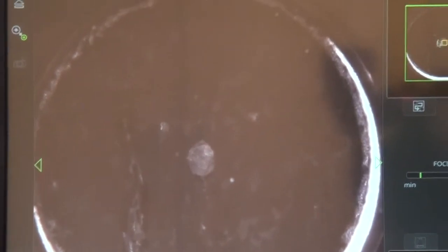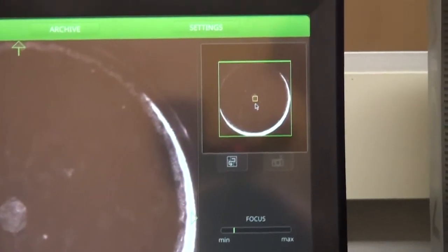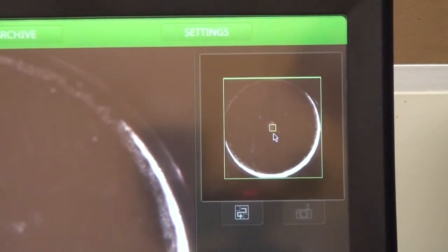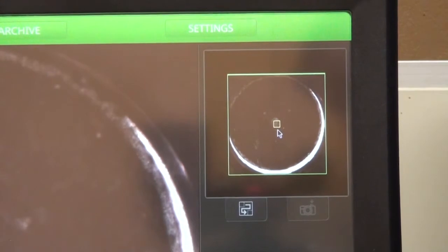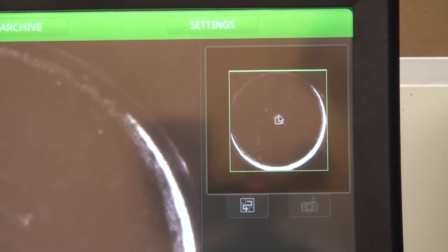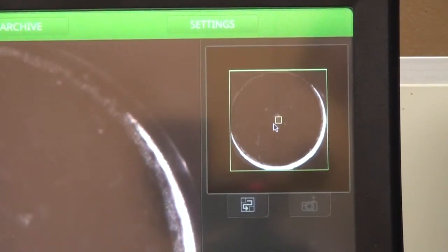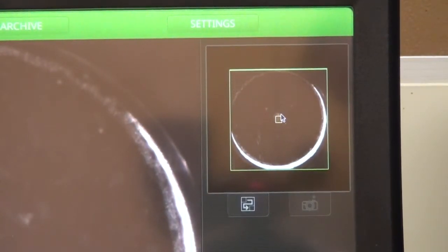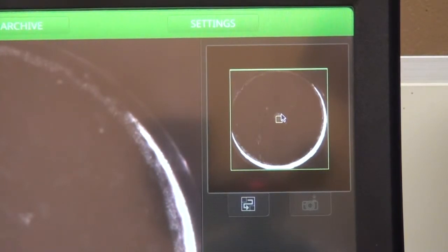The image is loaded in the small viewing window to the right, and it acts as an optical GPS to move the electron beam across the sample when we use the SEM mode.